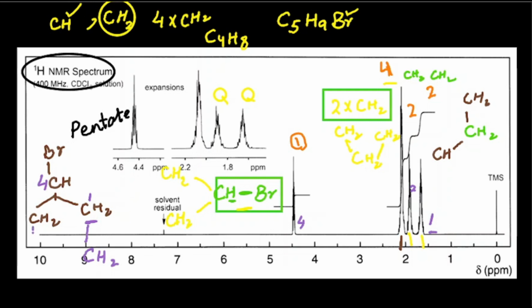So it means here the CH2 group is attached. Okay, now this is due to the peak number 3. This is due to the peak number 2. And this is the peak number 3. This gives you a pattern that CH2 group is present, 2 type CH2 group that is attached on either side with the CH2.